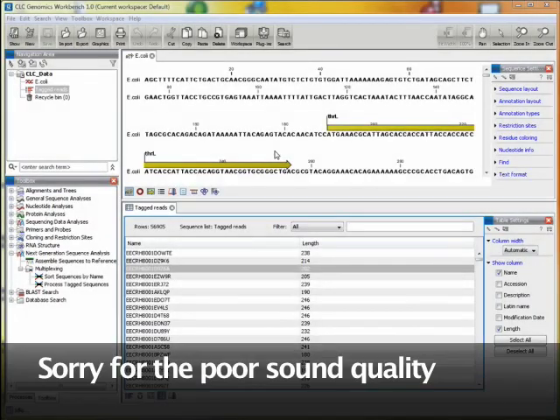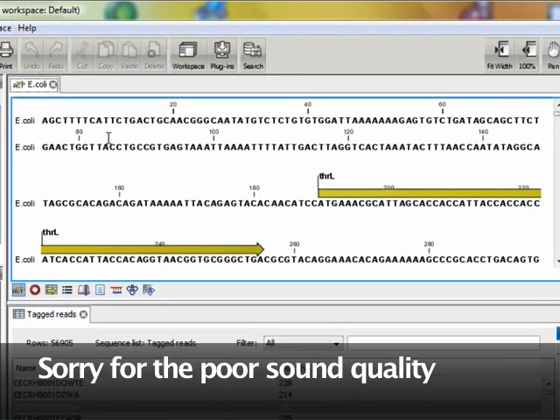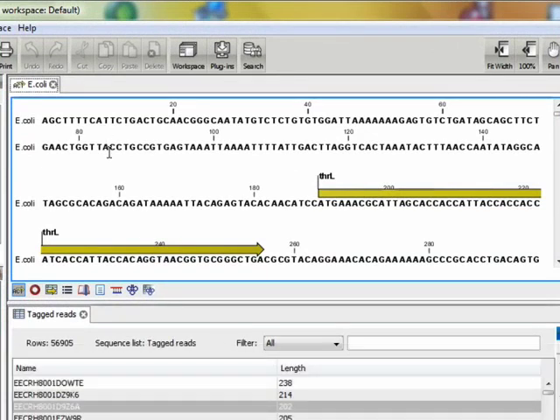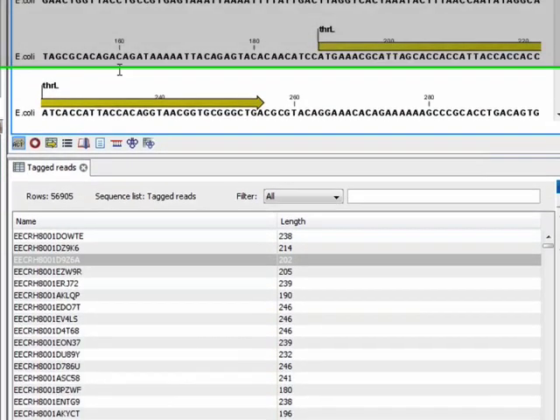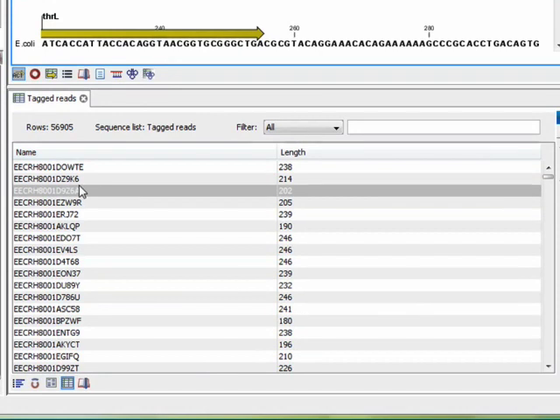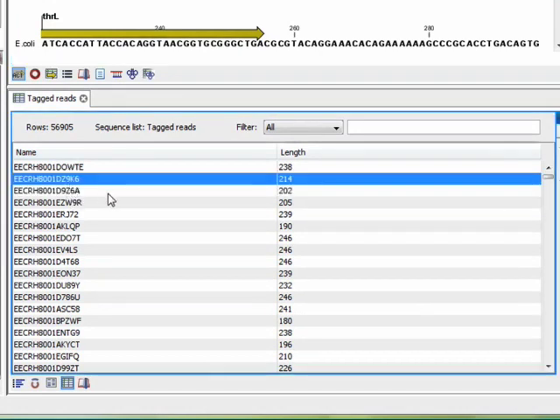This is the genomics workbench. What I have here in my workspace is the E. coli genome downloaded from NCBI and the simulated result of a sequencing run on that genome.